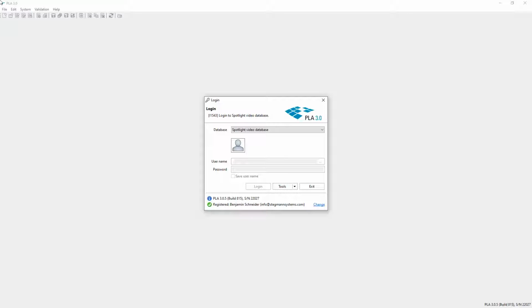Note that this conversion is required due to changes in deployment. It does not change the package version or impact your data and results. You can continue to work with your package version.